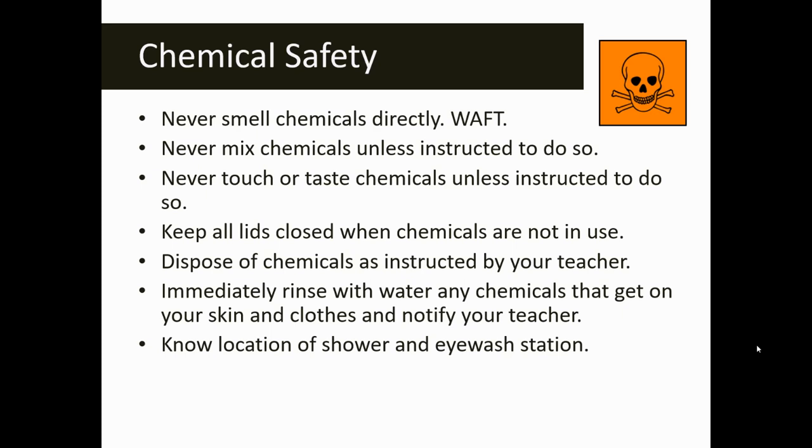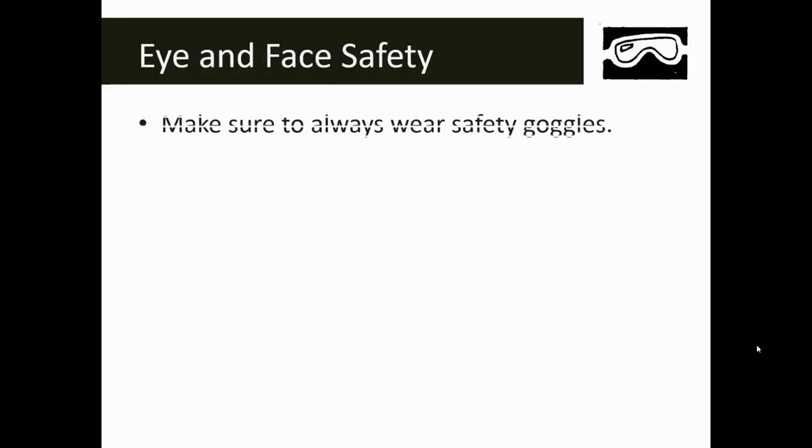Make sure that you know the location of the shower and eyewash station — your teacher has these in their classroom and will show you where they're located and how to properly use them. The safety goggles symbol is the eye and face safety symbol. You're going to see this symbol paired with the glassware, fire, heat, and chemical safety symbols. Make sure that you use eye protection anytime you use chemicals, fire, heat, or glassware.